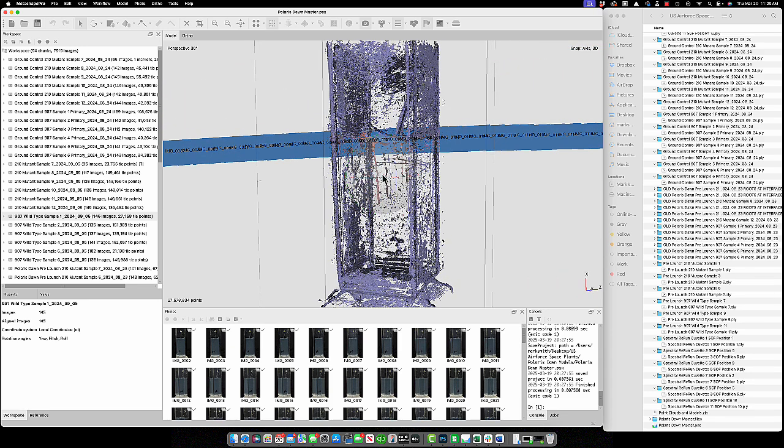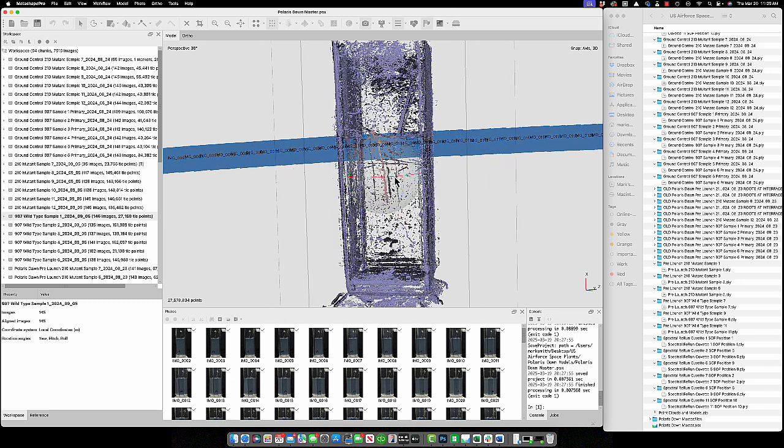So as before, where I just took the information that you can see highlighted, now I've gone back to the dense point cloud. I'm going to eliminate all the noise, and I'm going to get all 4 of these root pathways to merge to generate one good file. So I'm not exactly sure if that's going to work out the way that I intend, but there is an appendment method that I'm going to be showing everybody how to use, and I think it's going to be beneficial because I think, at least for me, it's been a common occurrence where I've had something where the photos were misaligned. However, the 2 point clouds that were output were good. They were just mismatched or in the wrong location. So that future video is going to show everyone how to merge those 2 without the use of markers, which is sometimes pretty inaccurate. So stay tuned for that.